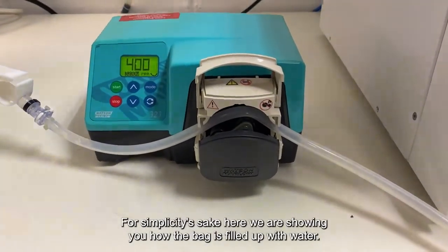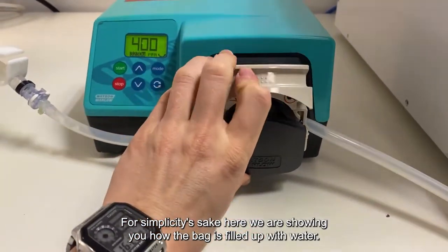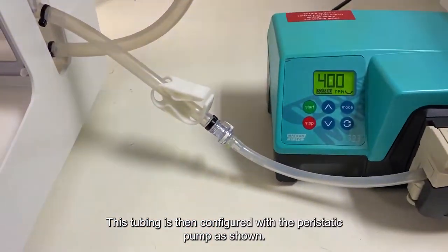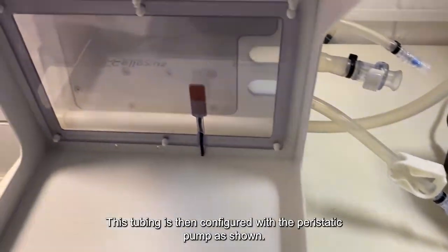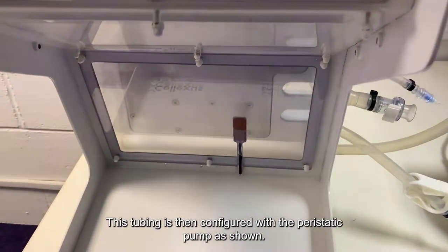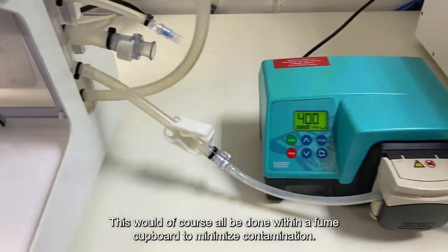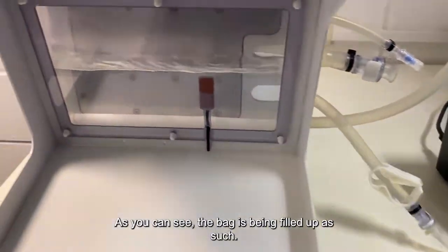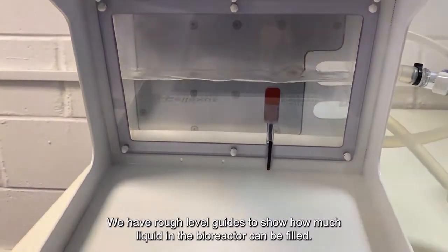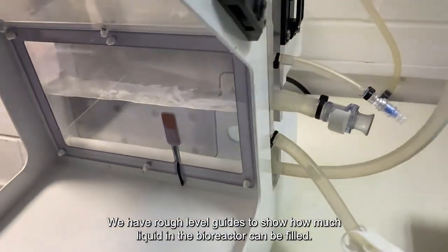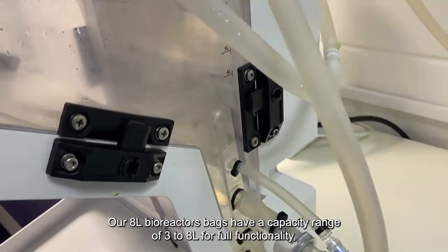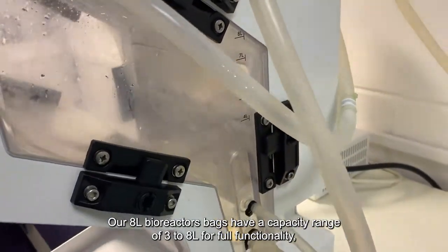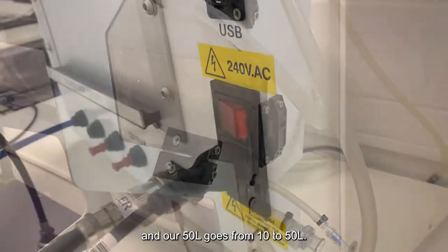For simplicity's sake, here we are showing how the bag is filled up with water. The tubing from the bag is connected from this female MPC connector. This tubing is then configured with the peristaltic pump as shown. This would of course all be done within a fume cover to minimise contamination. And as you can see, the bag is being filled up as such. We have rough level guides to show how much liquid in the bioreactor can be filled. Our 8 litre bioreactor bags have a capacity range of 3 to 8 litres for full functionality, and our 50 goes from 10 to 50 litres.